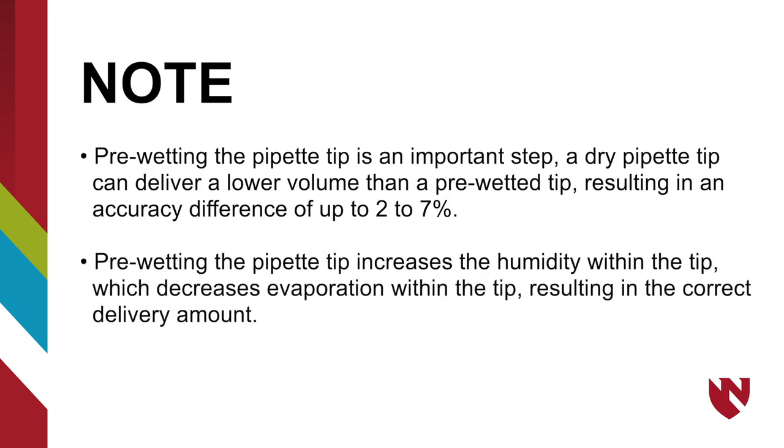Pre-wetting the pipette tip increases the humidity within the tip which decreases evaporation within the tip resulting in the correct delivery amount.